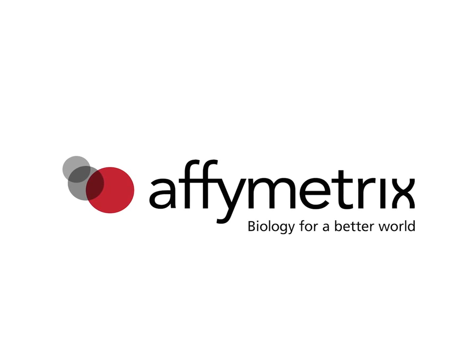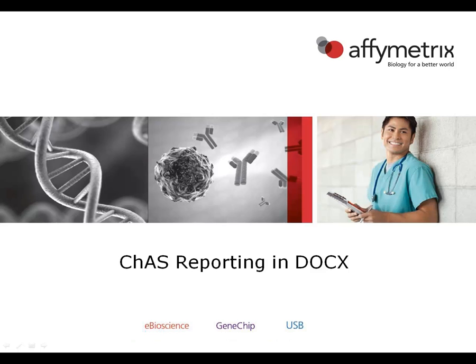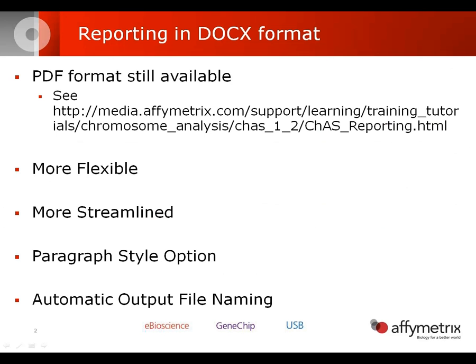In this module, we'll walk through exporting graphs and tables out of the ChAS browser in a Word or Docs format. Previous versions of ChAS, you were able to export the tables and graphs in a PDF format. This is still available. There is a tutorial on how to export graphs and tables in the PDF format available at the link seen here on the Affymetrix website.